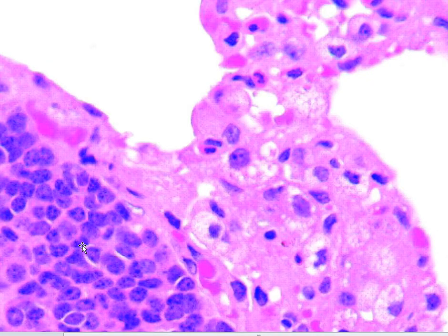Here's a higher power view of the cells, and certainly in the southwest over here, these are virtually all tumor cells. Here are a few more tumor cells, which you could see here, perhaps mixed in with some fibrin and perhaps inflammatory cells. But the tumor cells here, you could see, have a lot of intranuclear inclusions. I would be very hard pressed to call these things nucleoli, especially areas like here and here. It looks like it's a diffuse clumping of the chromatin.